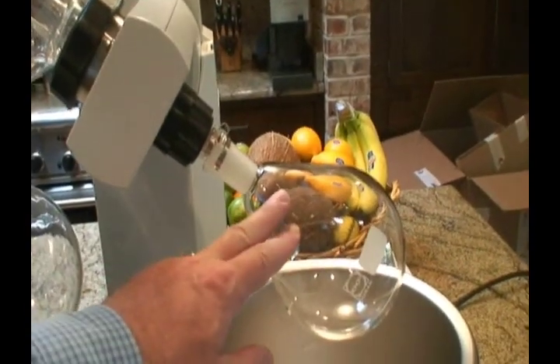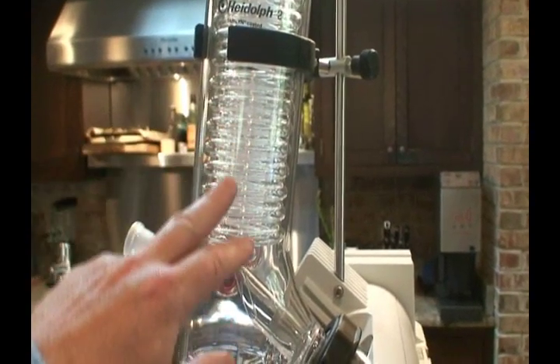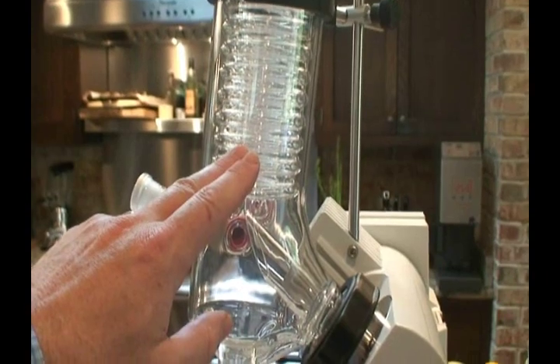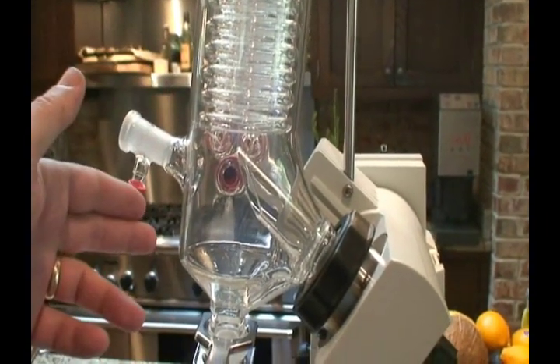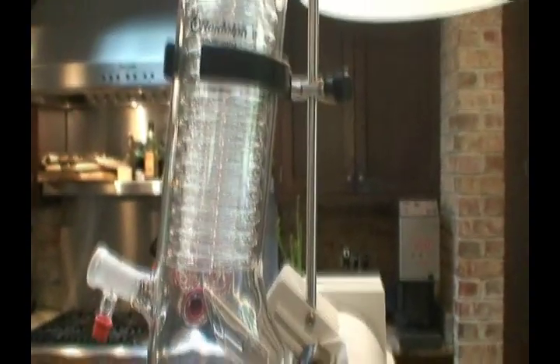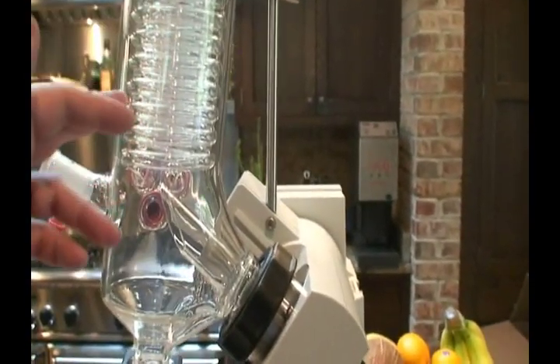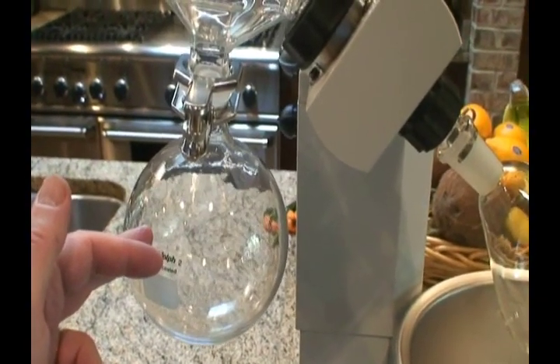The liquid is going to travel from this flask through the vapor duct up into the condenser area. We're going to circulate a low-temperature fluid using one of the PolyScience refrigerated circulators — propylene glycol through that coil. The vapor hits the coil, condenses, and will be captured in the receiving flask.